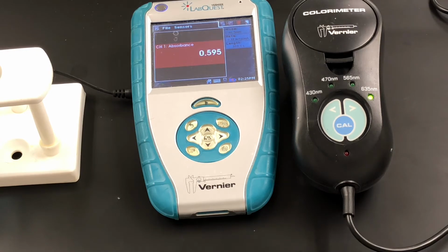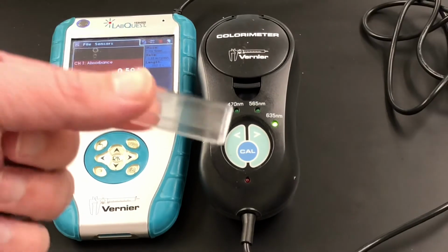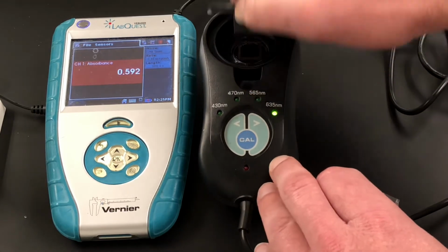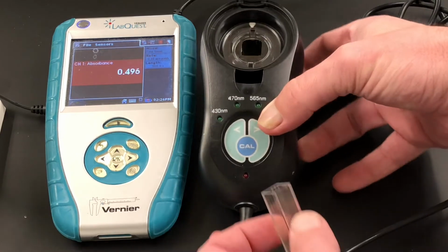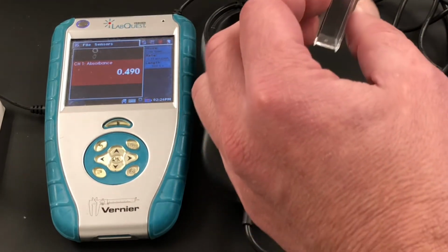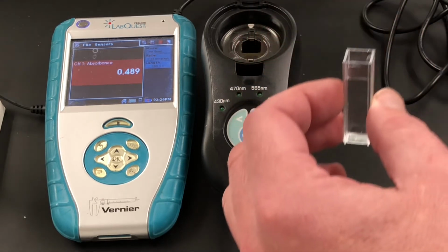The first thing we want to do is calibrate our machine. Remember that while the absorbance of something clear is not going to be very large, there still will probably be a tiny little bit going on. Right now we're actually getting an absorbance. When you open up the machine, you'll see this is where the cuvette fits, and there's nothing in there, but we're still getting some type of absorbance. Just like when we weigh something on the digital scale, we want to tare it. So we're going to fill this with plain old distilled water, since distilled water is what we used to make all of our solutions.